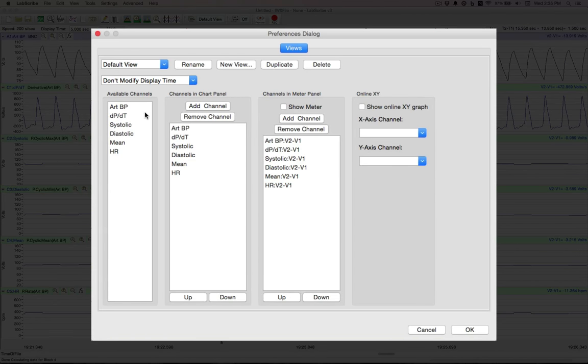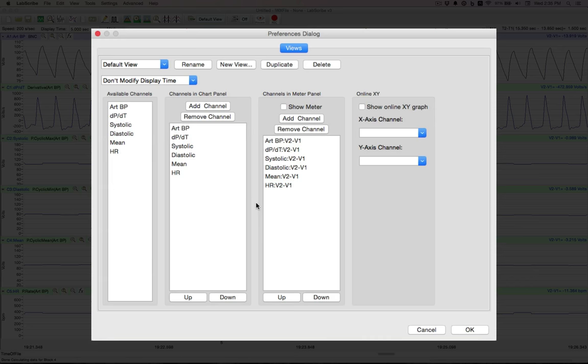On the left side here, these are the available channels we can take the information from. And these are the ones displayed, which we have right now. The right side here, we leave for another video.